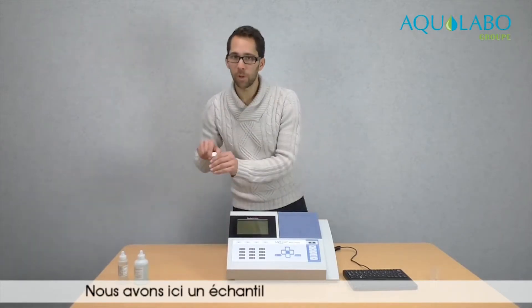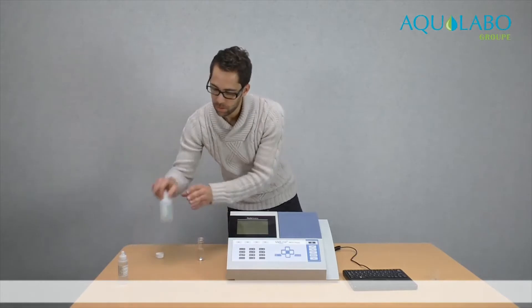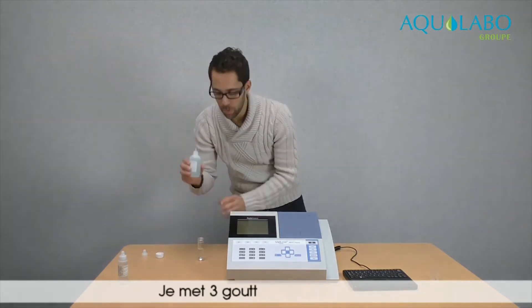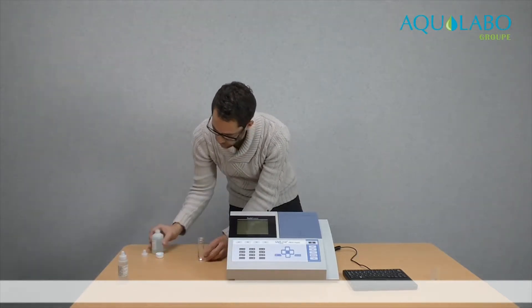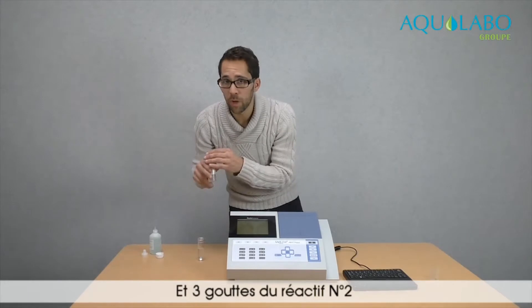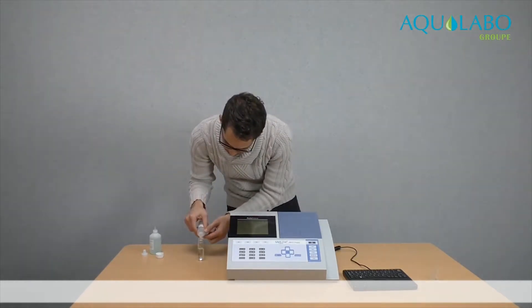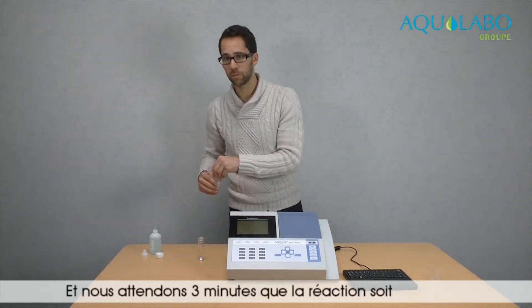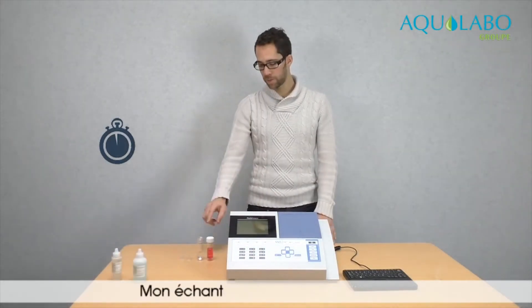Here is a sample of water containing nitrates, and here is a kit of reagents for nitrates. I put three drops of the first reagent and three drops of the second reagent. And then we wait three minutes for the reaction. Now my sample is ready.